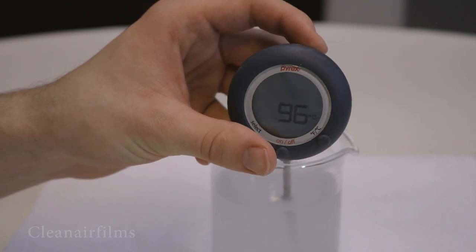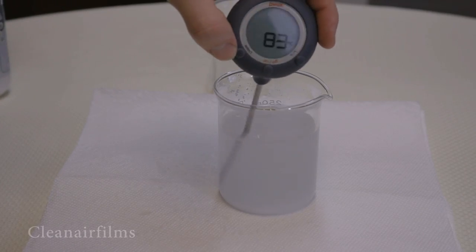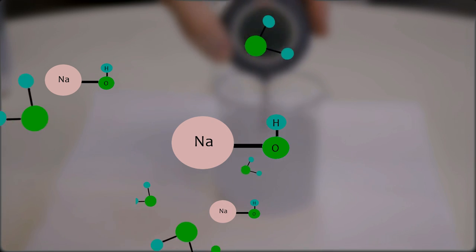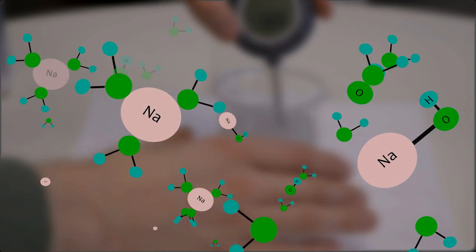Lye is highly soluble in water and is an ionic compound. When it dissolved in the water it separated into its Na and OH ions.